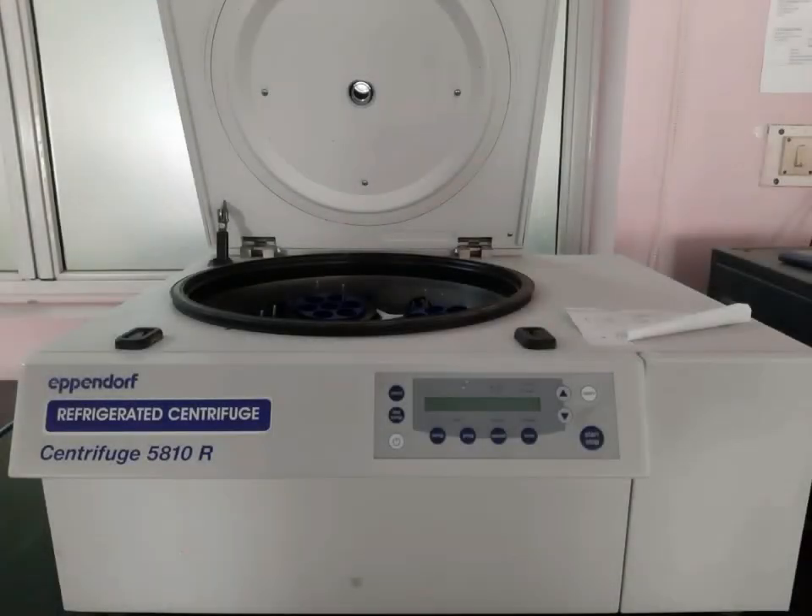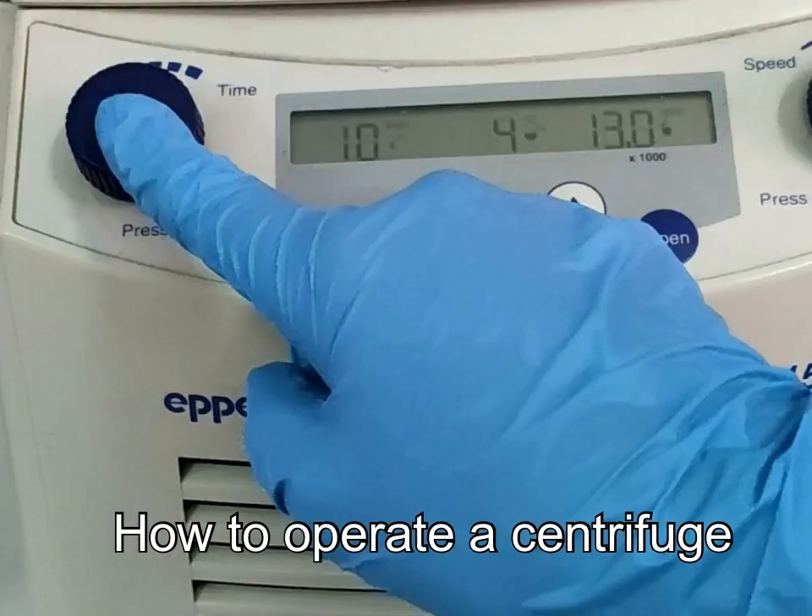In this video, we will be talking about centrifuges, types of centrifuges, and how to operate a centrifuge.